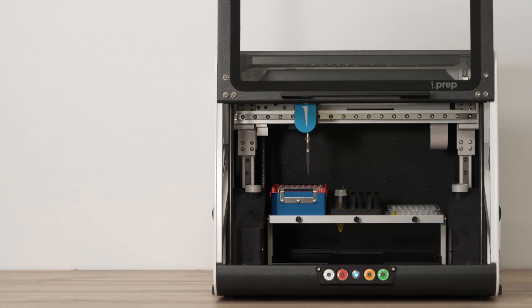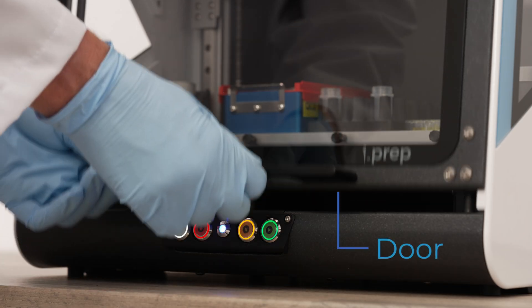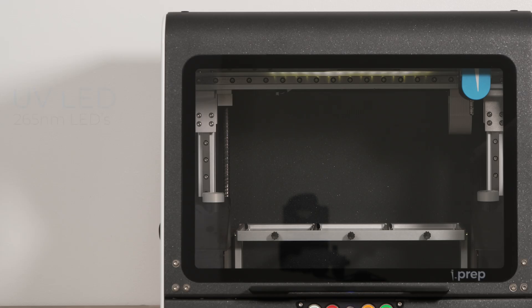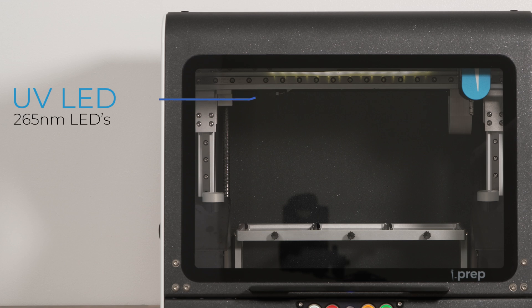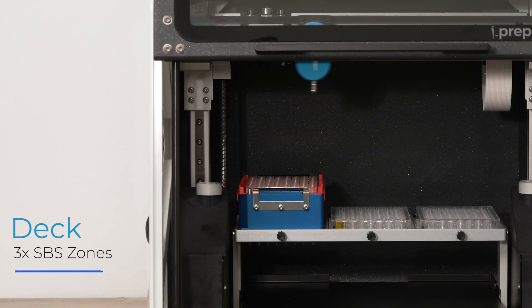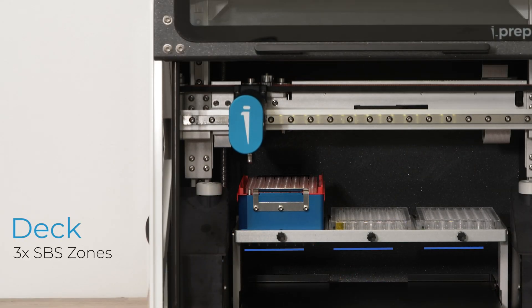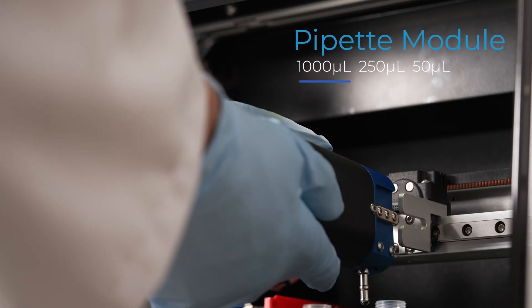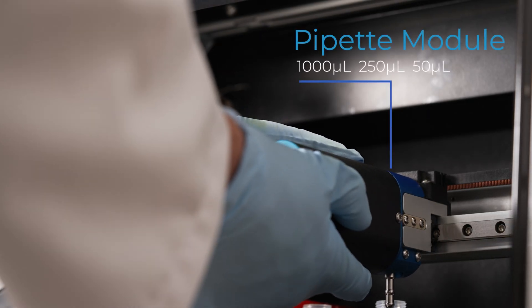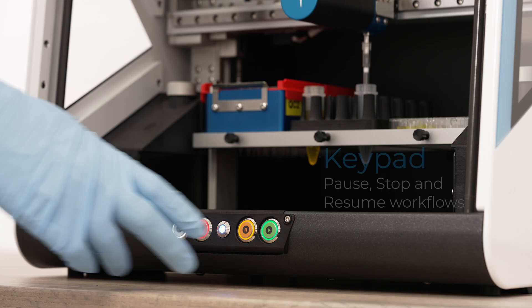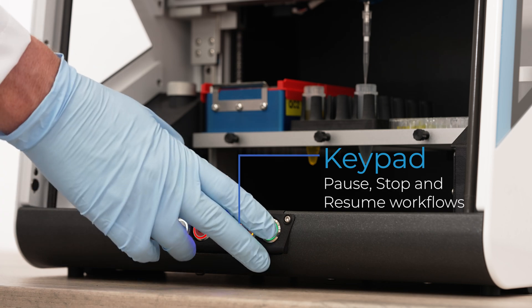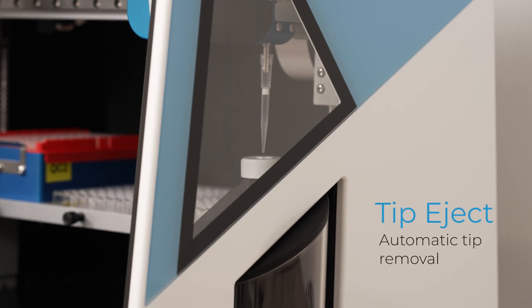iPrep product features include a vertically sliding door for access to the system, a UV LED for assisting your sterilization process, a moving deck including three zones sized for SBS plate objects, a pipette module for aspirating and dispensing liquids, buttons for pausing and resuming workflows, and a tip eject.